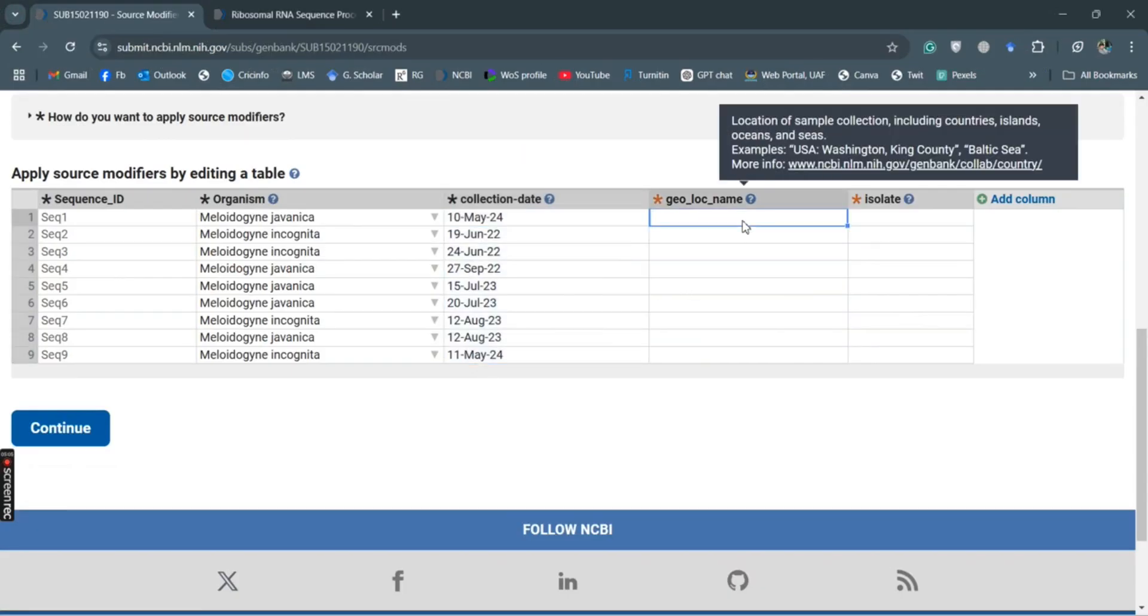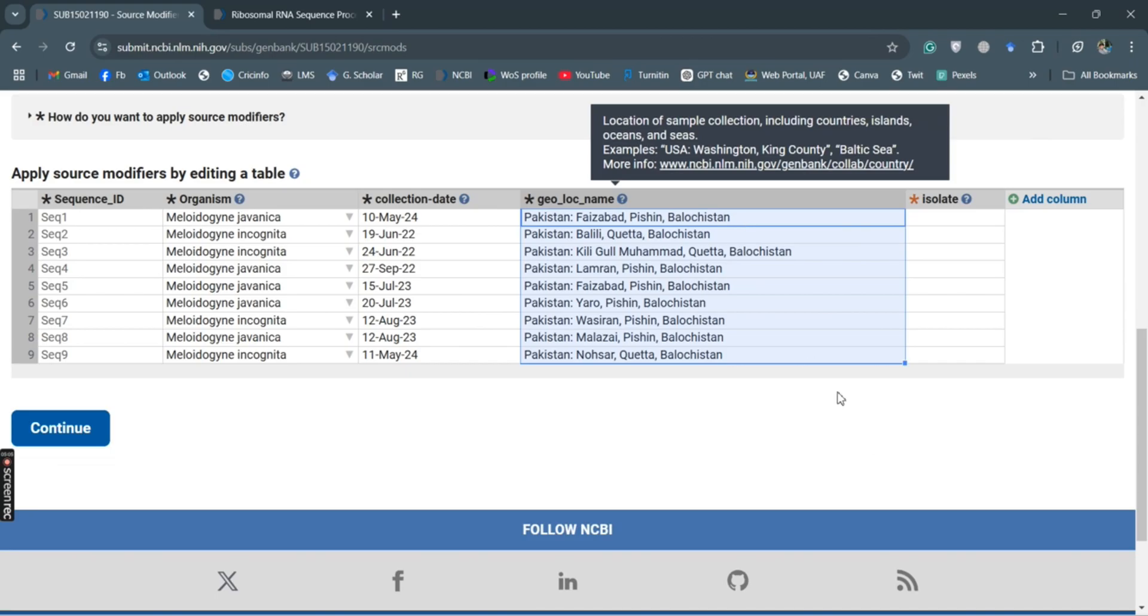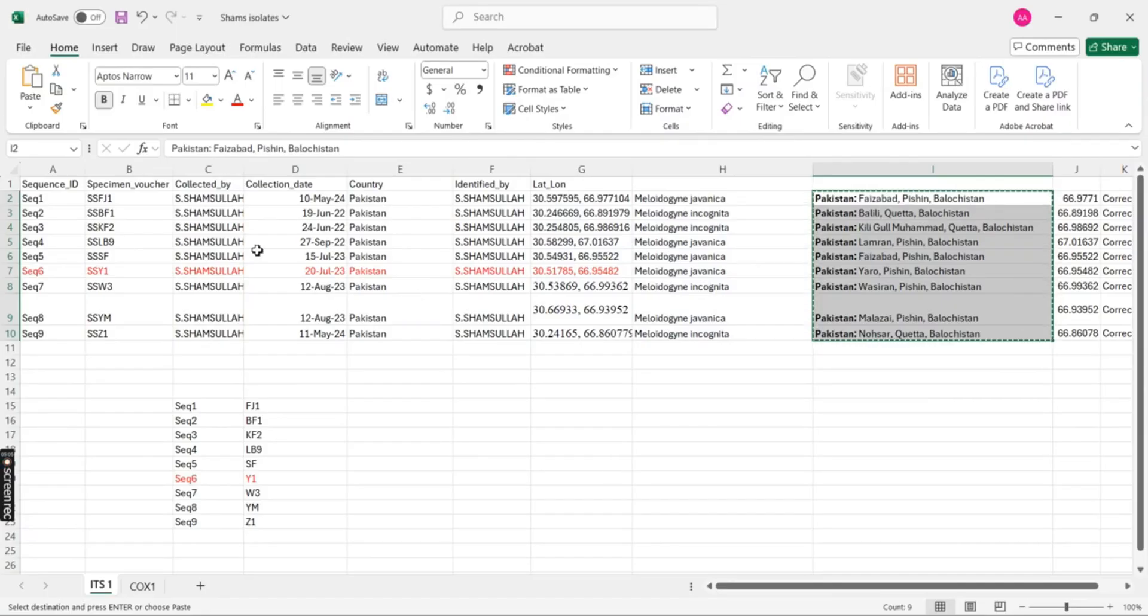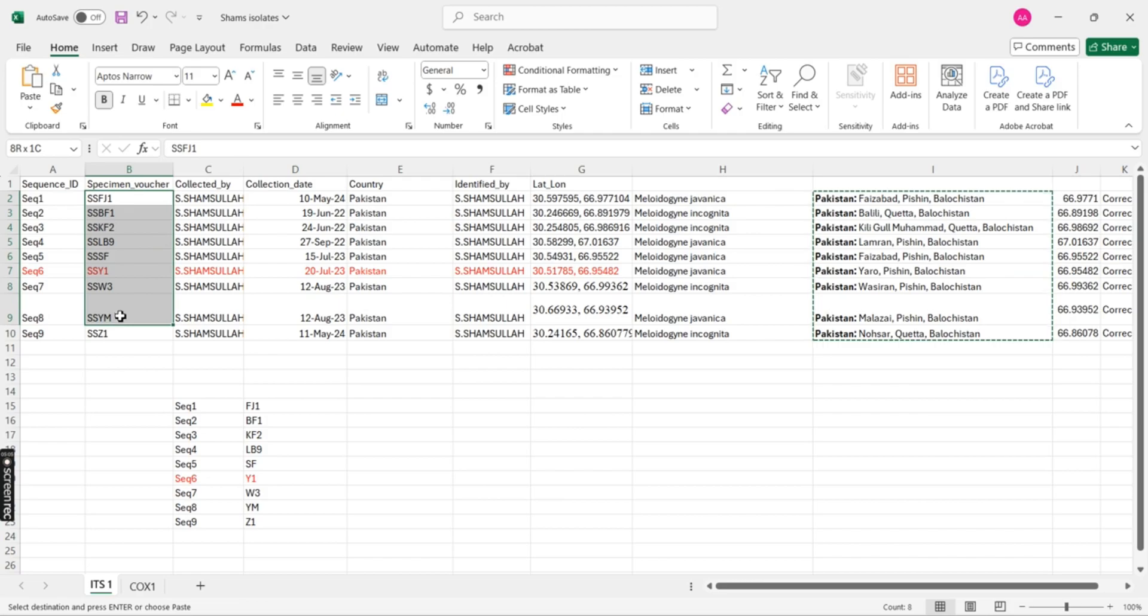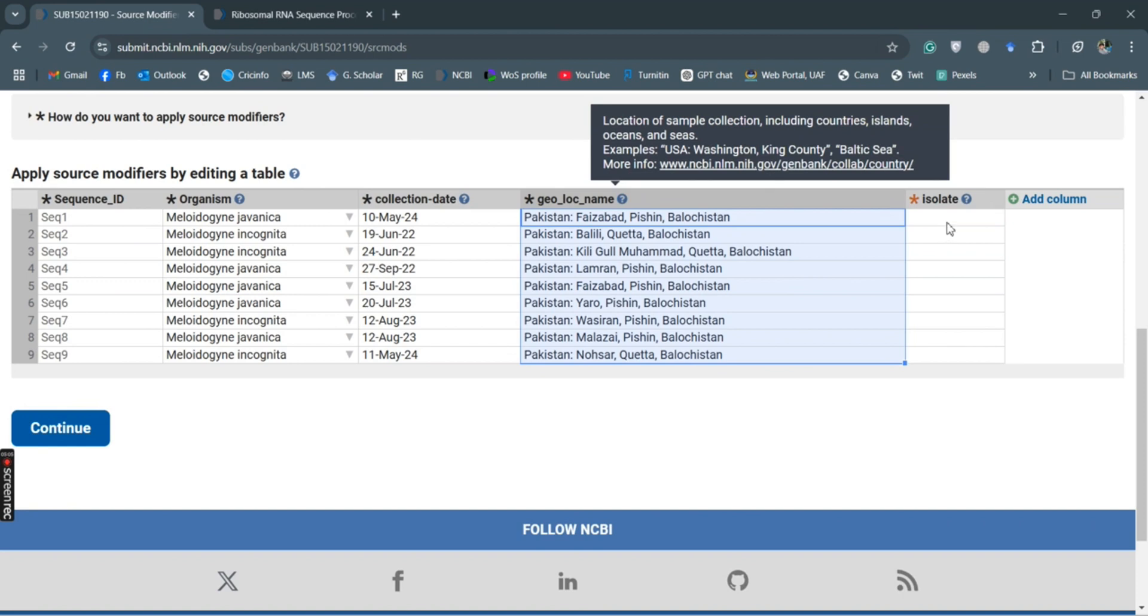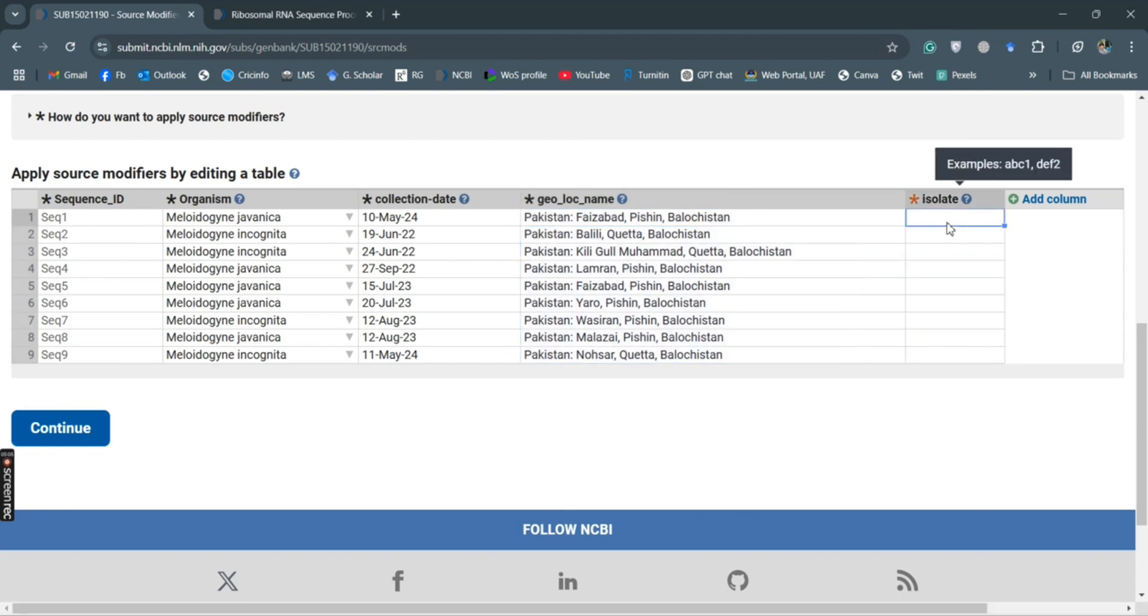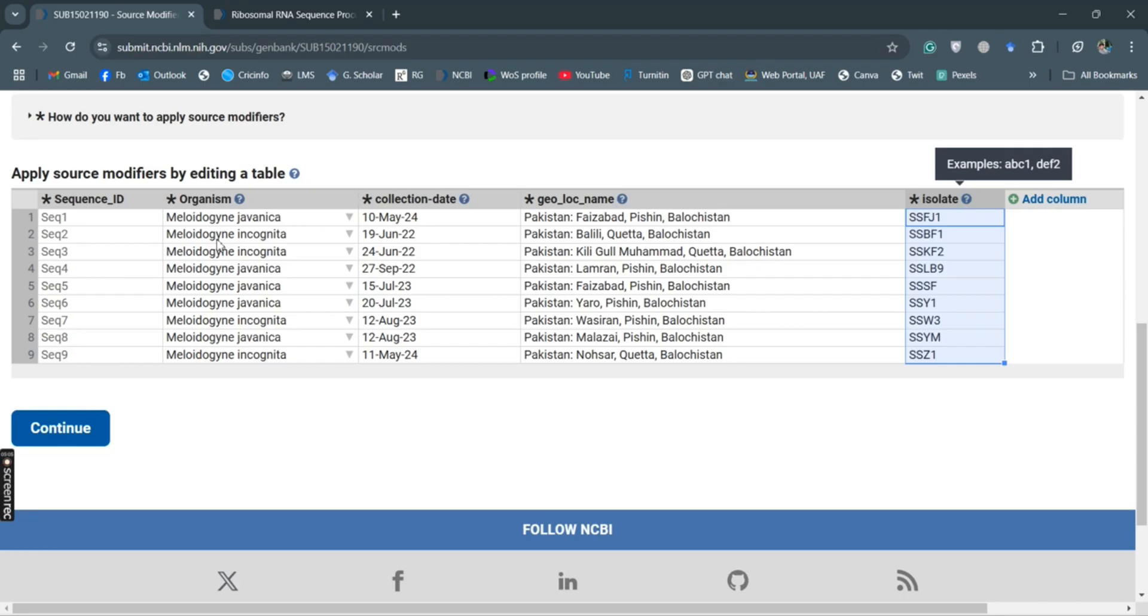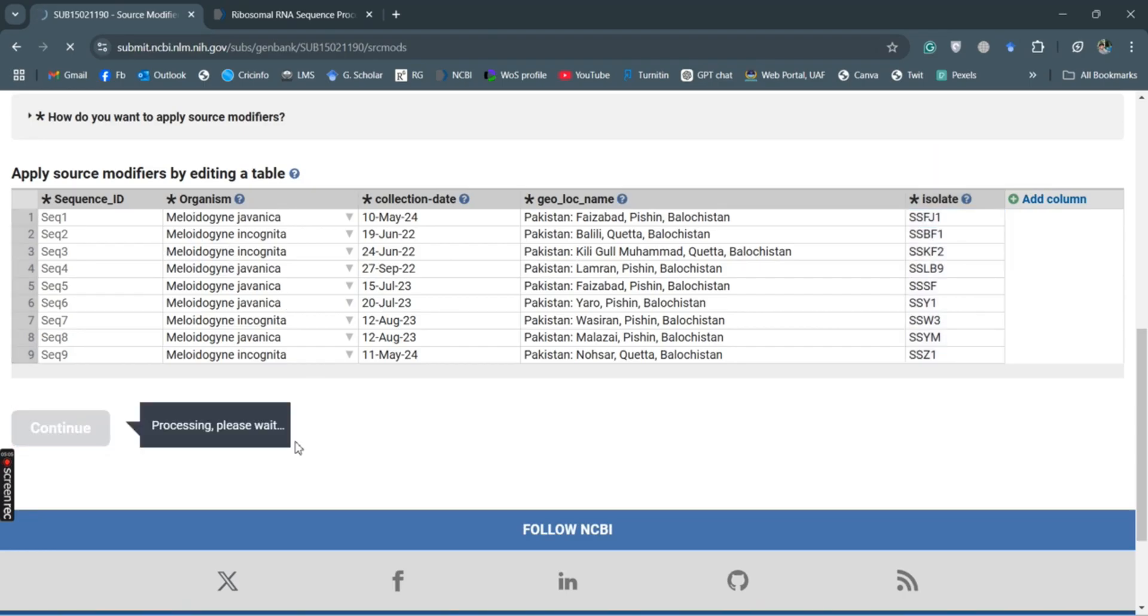And then the names of isolates, so here are the names of isolates. So if you want to add some other columns, some other information as well, you can add this information. Because this information is mandatory, so I will continue with that.